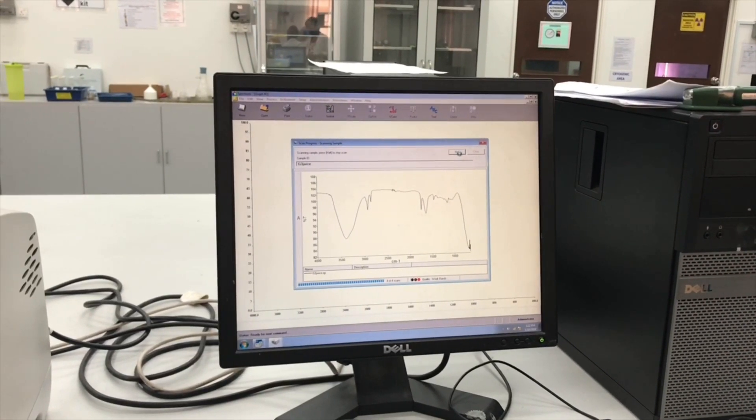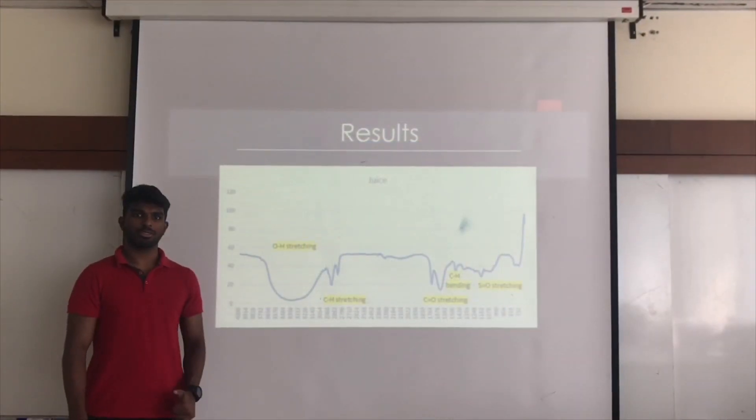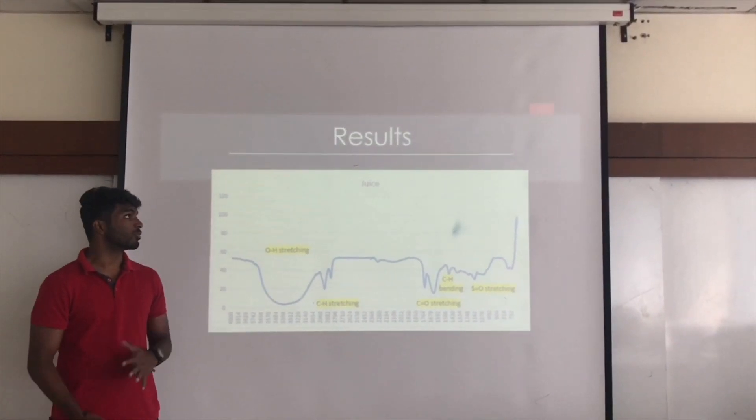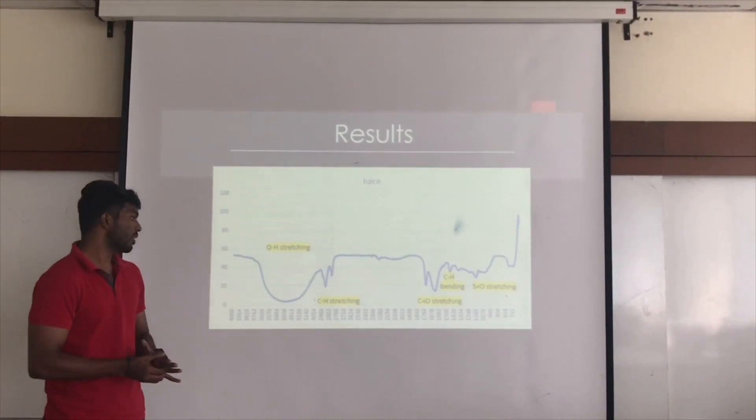Now let's hear some explanation from Mr. Sivan. So now we are going to head on to results. You can see the results over here.